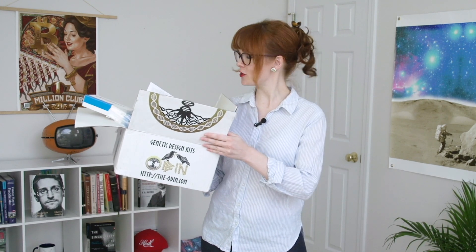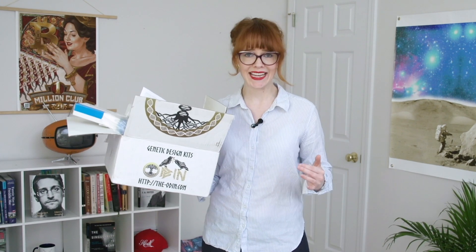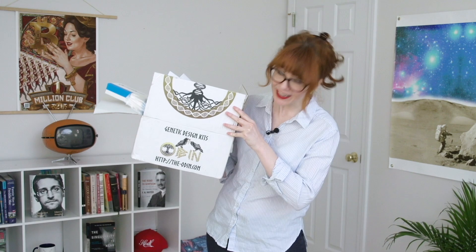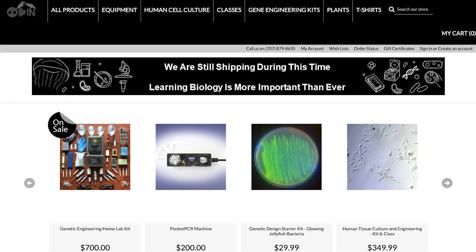This genetic engineering kit is going to teach me how to add jellyfish DNA to yeast in order to turn the yeast fluorescent. It's one of the fantastic biohacking kits from The Odin, which gives people the tools to do all kinds of awesome science experiments at home. We're using a process called transformation, where you genetically alter a cell by introducing new DNA through the cell walls.